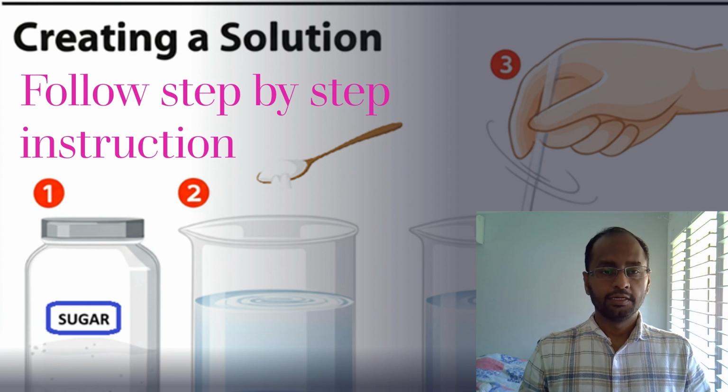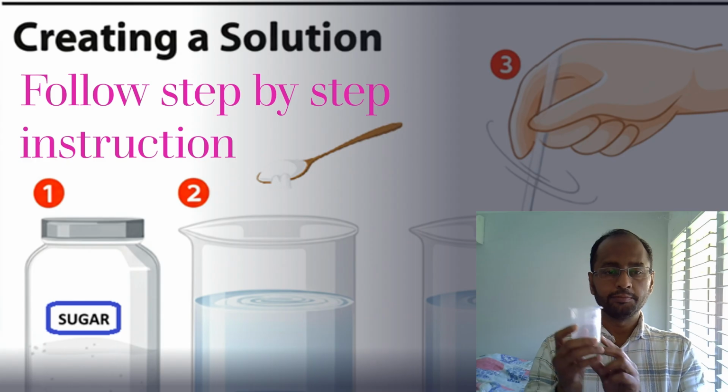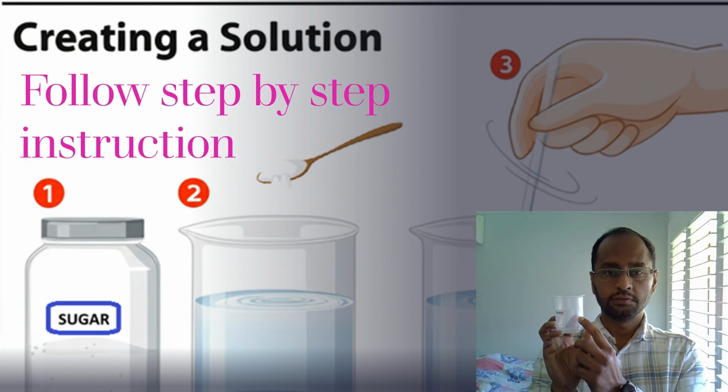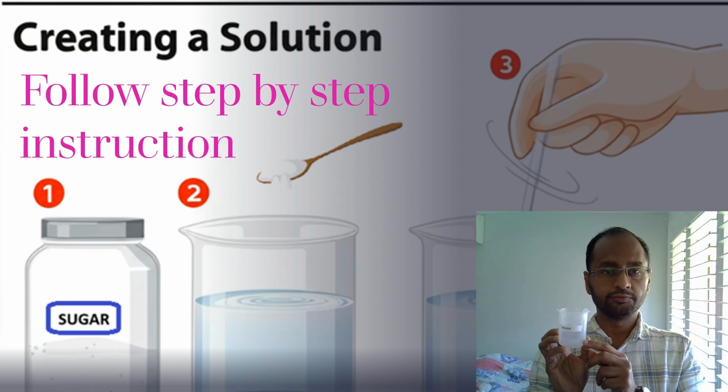Great. Okay. Now, step number two, you need to label your beakers hot, warm, and cold. Use the labels and the markers right over there. So you'll have three beakers, each one with a clear label on it.